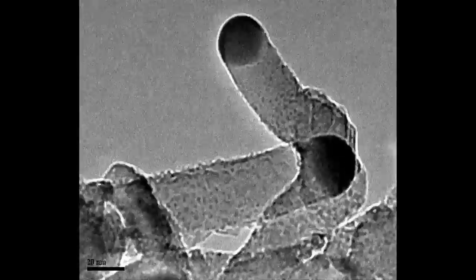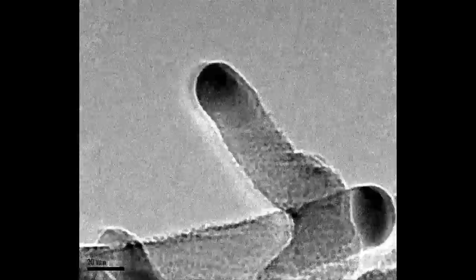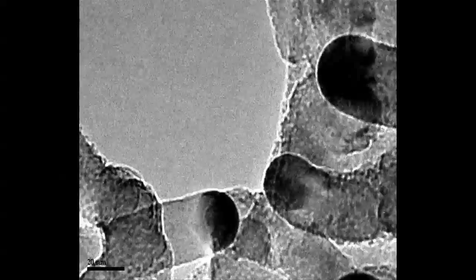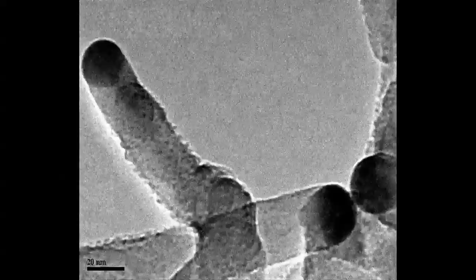This video was obtained through an exciting and relatively new microscopy technique that allows us to study the growth of nanowires in real time with atomic resolution.